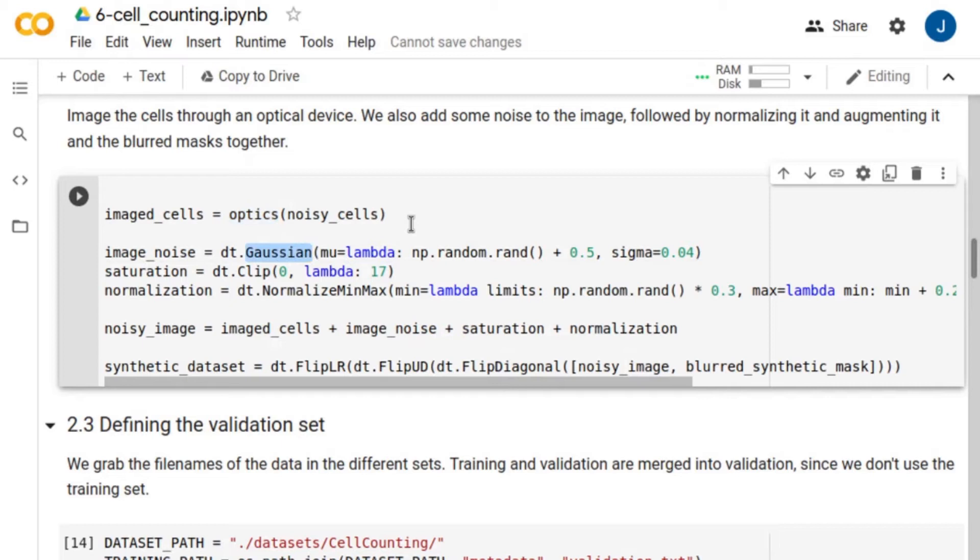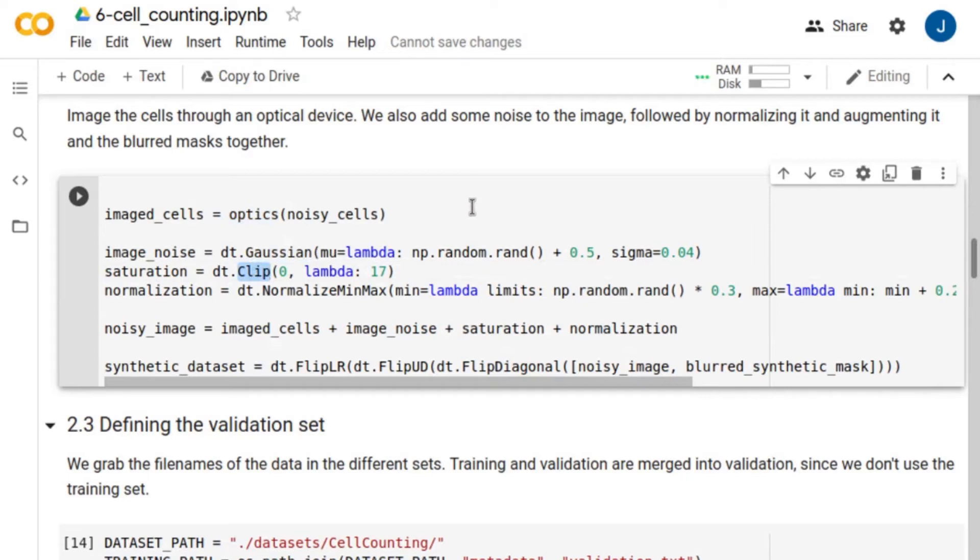In experimental images, we have pixel intensity saturated regions. To simulate this, we clip the images within a minimum and maximum value. This range, of course, depends on your specific application. And finally, the images are normalized.